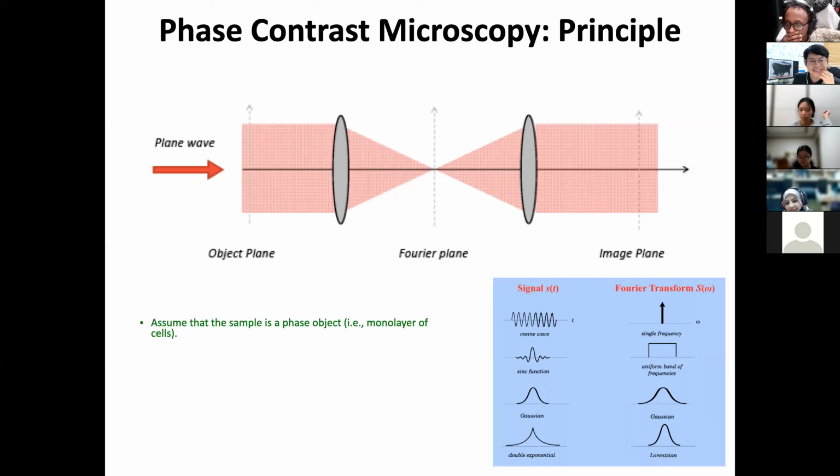Okay, so don't worry. You have to resort to your intuition first before even considering mathematics. Look at this. At the object plane, the intensity is constant, and it lands at the focal plane. You see what happens: the focus is down, there's only light at this point of 0, while elsewhere there is none. We call this mathematically a delta function. So the Fourier transform of a constant is a delta function.